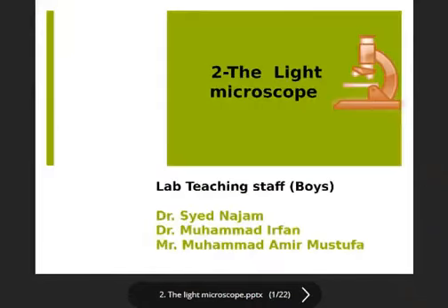This is our second experiment. You can see on the screen. This experiment is about the light microscope. Micro means very, very small, so small that you cannot see it using your eyes. So you need a machine, you need help. This is the machine that will zoom the object so that you can see it properly.